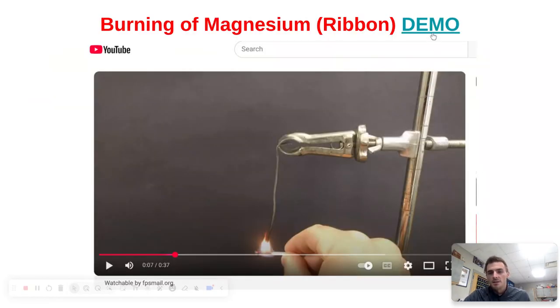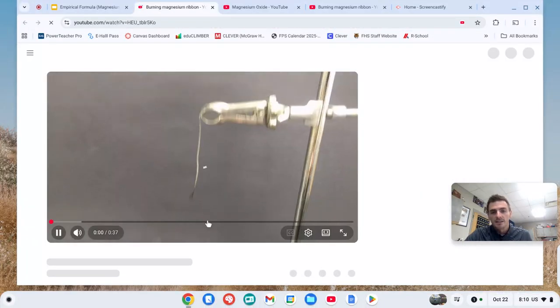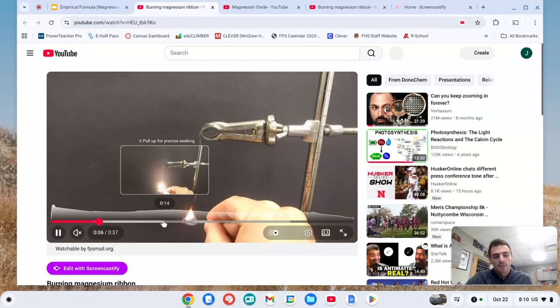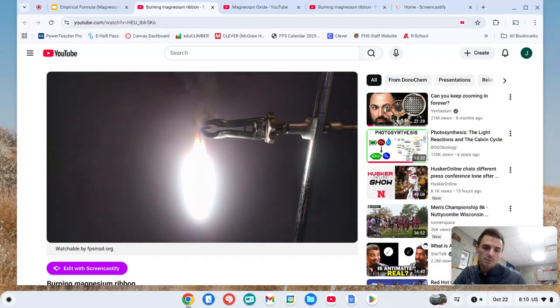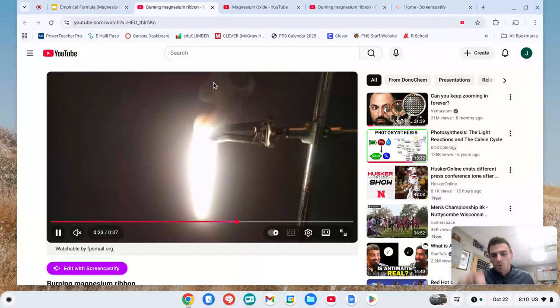It's important, it says in the lab, that we don't ever want to just be burning this magnesium purely in the air, for safety reasons. When magnesium burns in the open air, it's a very, very bright flame, and we don't want to do that for our eye safety. We'll have goggles on regardless, but the other problem is that right now, that's not just smoke we see there, that would be magnesium oxide escaping.